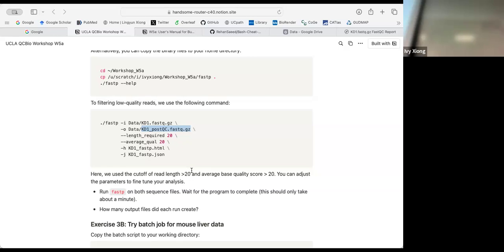Oh, enterprise is weird. You can try terminal on that or on Mac. It's way simpler. Yeah, I see that's a bit junky. I'm doing this on my... Yeah, try terminal.